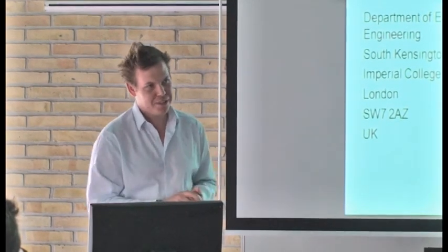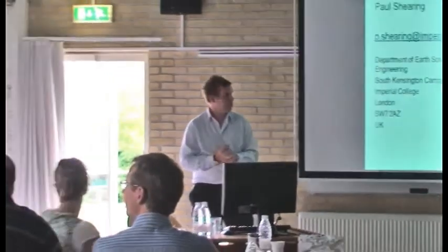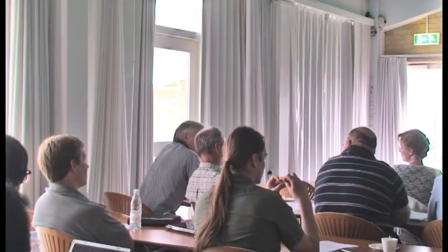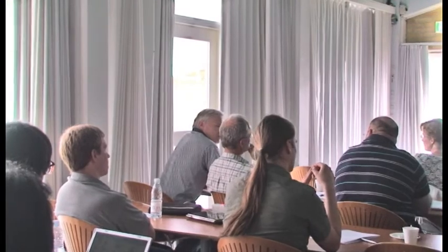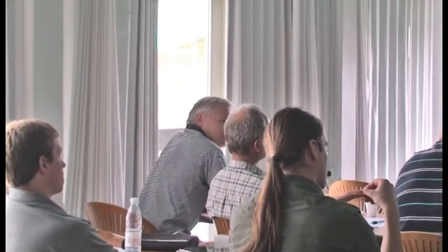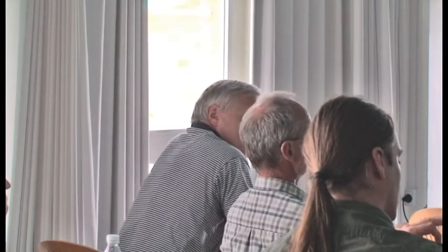I'll ask the X-ray guys and see what they say about that, but we do know there's no heating from the X-ray. Maybe Henning can comment on this. I would guess that you would have a local heating of the order of millikelvins. It's true that with synchrotrons you can have severe problems when you have polymers and that sort of thing, but it's more to do with the fact that you can generate free radicals. So you don't care about that in these materials at all. So I would hope that there would be zero.